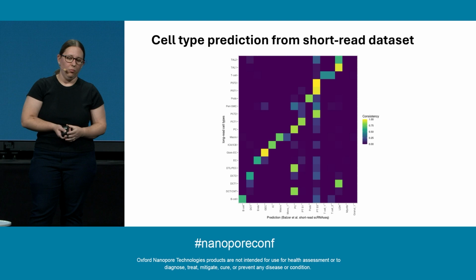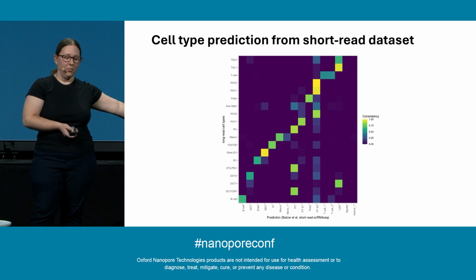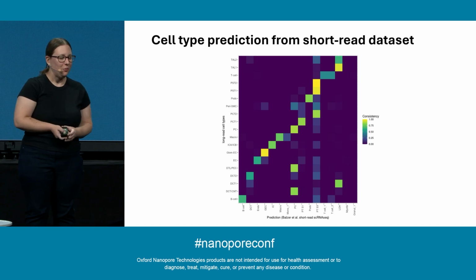And I will say, with the new implementation of Dorado, even that part of the analysis has greatly improved. I don't have the other data set, but it looks a lot better. So I think everything seems to be improving for this kind of workflow.